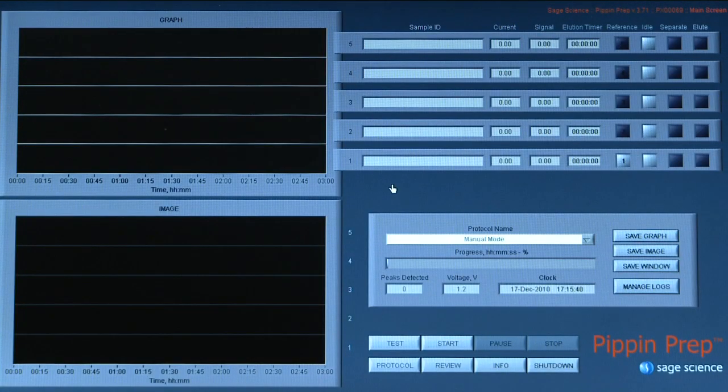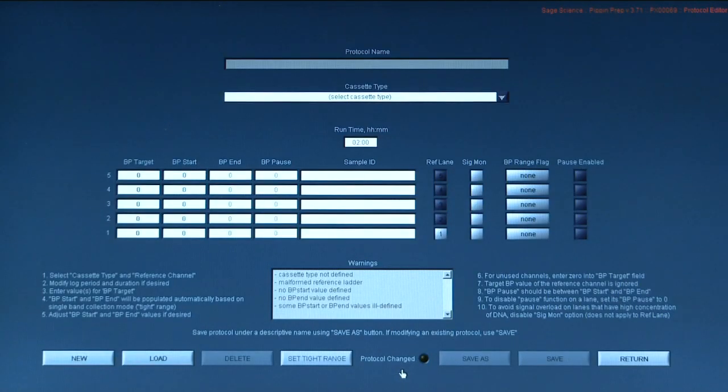From the main screen, click the Protocol button. To program a protocol, select the correct type of cassette. Designate a reference lane.